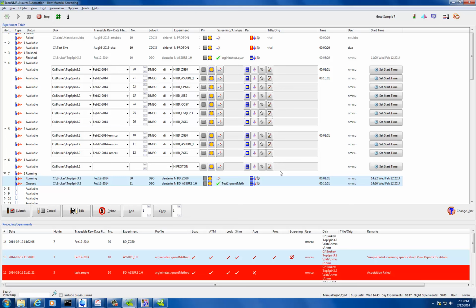Now it's running. It's still there, it's going to go down eventually. So now it's going to run both of them.